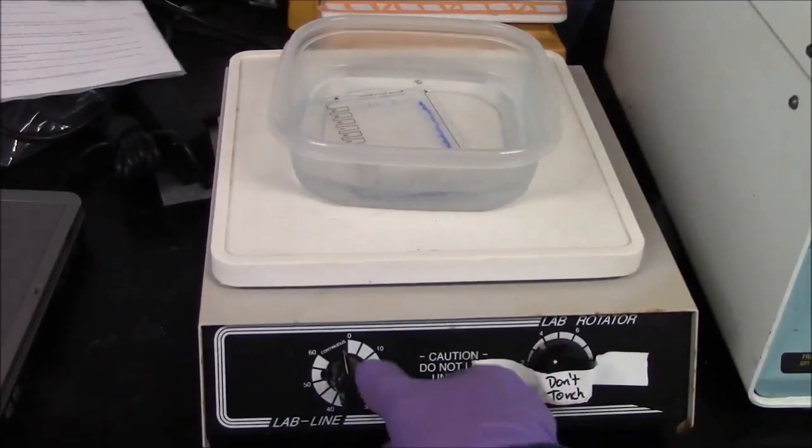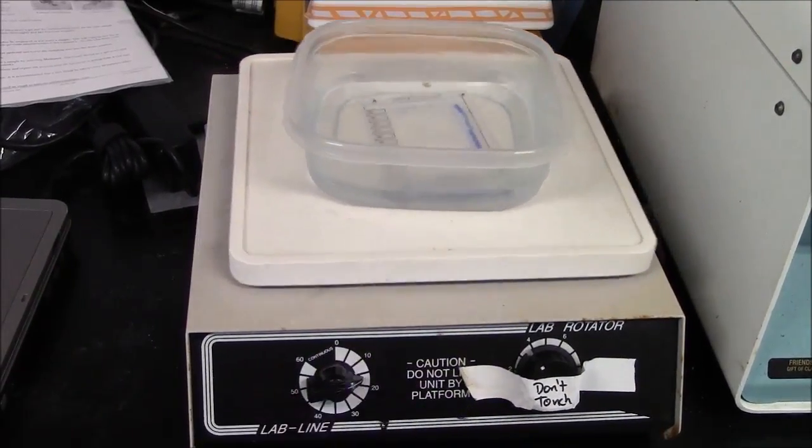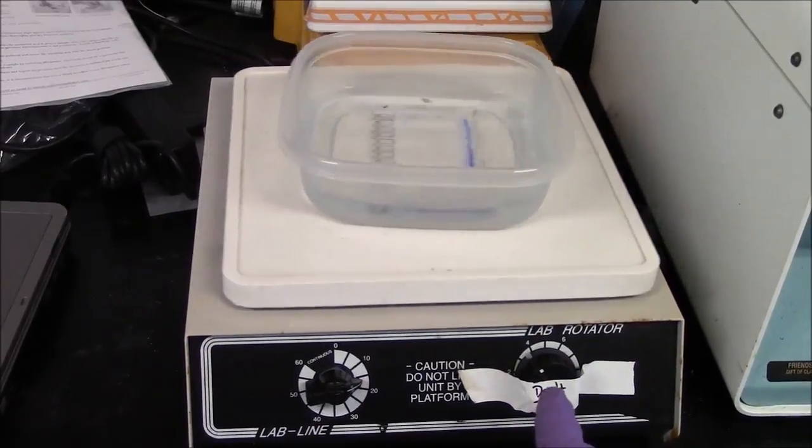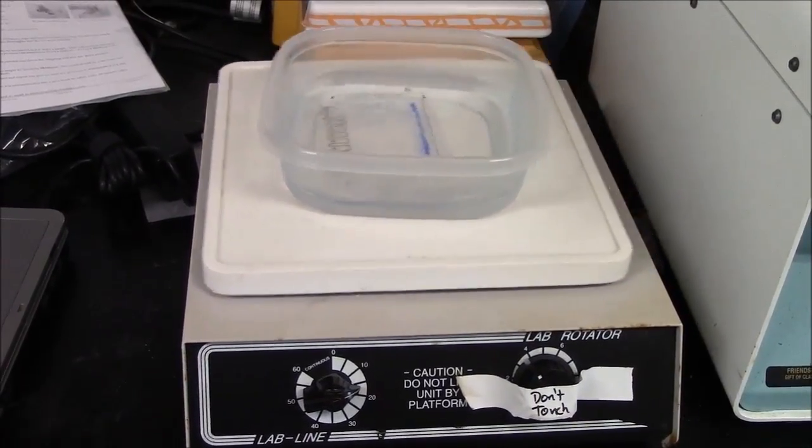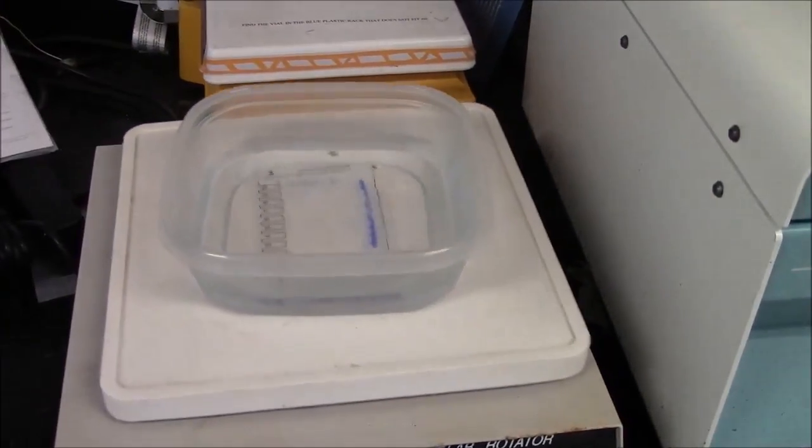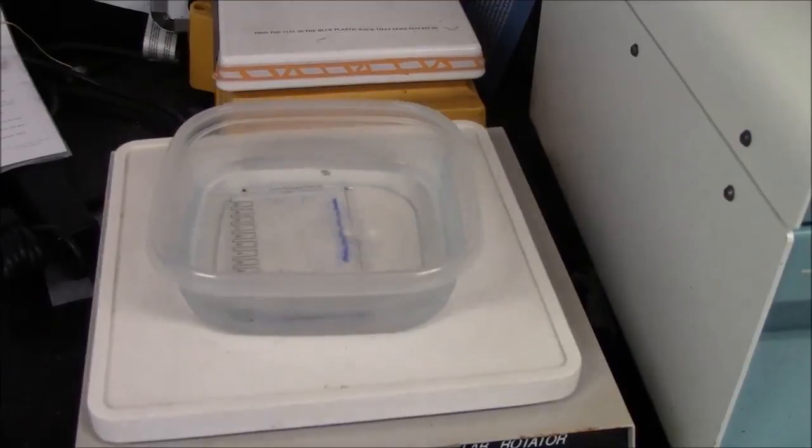So here now we have the gel in a Tupperware tub. This is our rotary shaker. This is a timer function. This is the speed function. As it says, you don't want to adjust the speed. And it will shake gently for about five minutes, and that time we hope that the gel lifts off the plate.